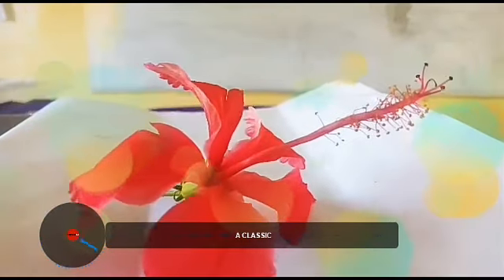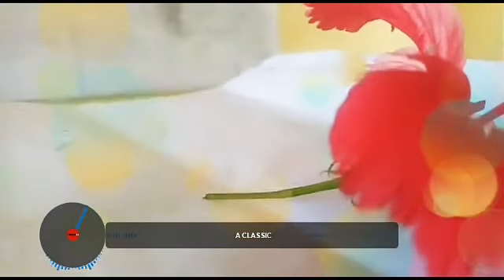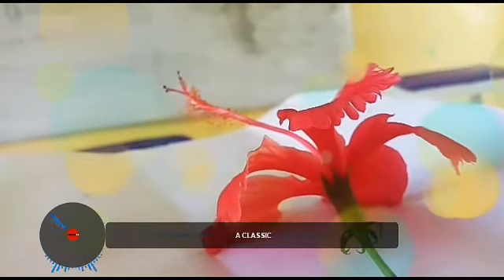Good day everyone. For today's class we shall be presenting a hibiscus flower. So this is the overview of the specimen. We shall be looking at the fundamental structures of this specimen.